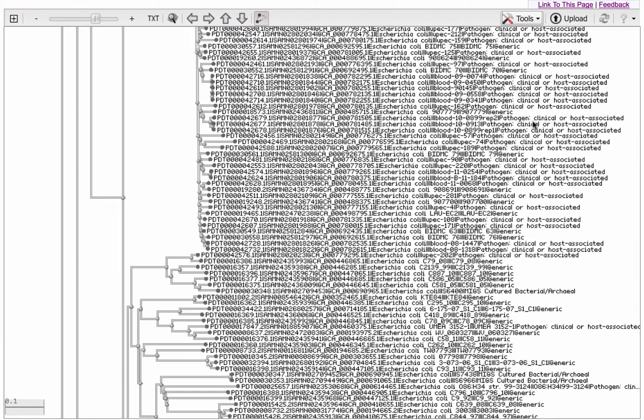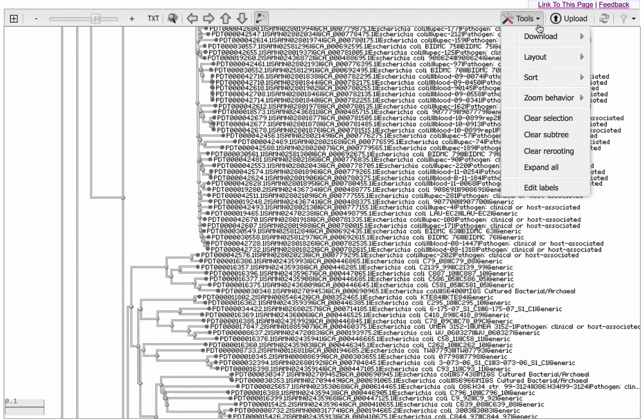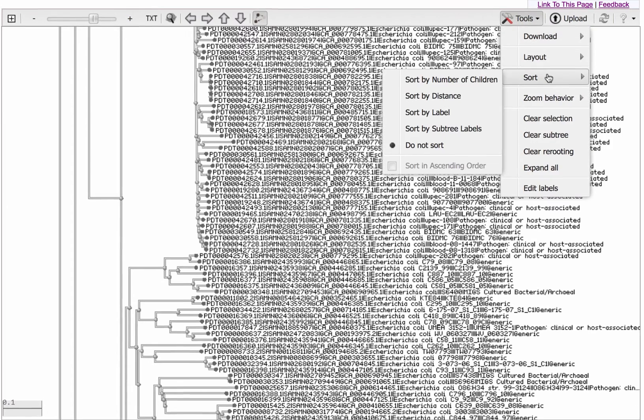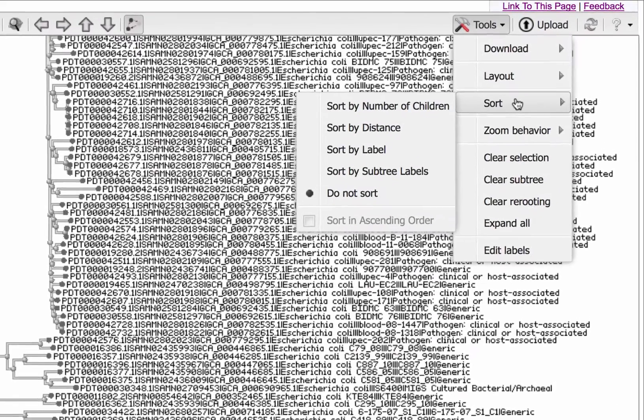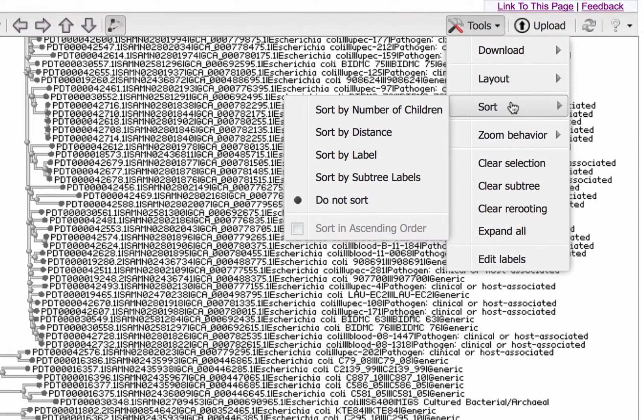Finally, I'll point out the Sort function. Under Tools, Sort, you can sort by number of children, distance, label, or by subtree label.